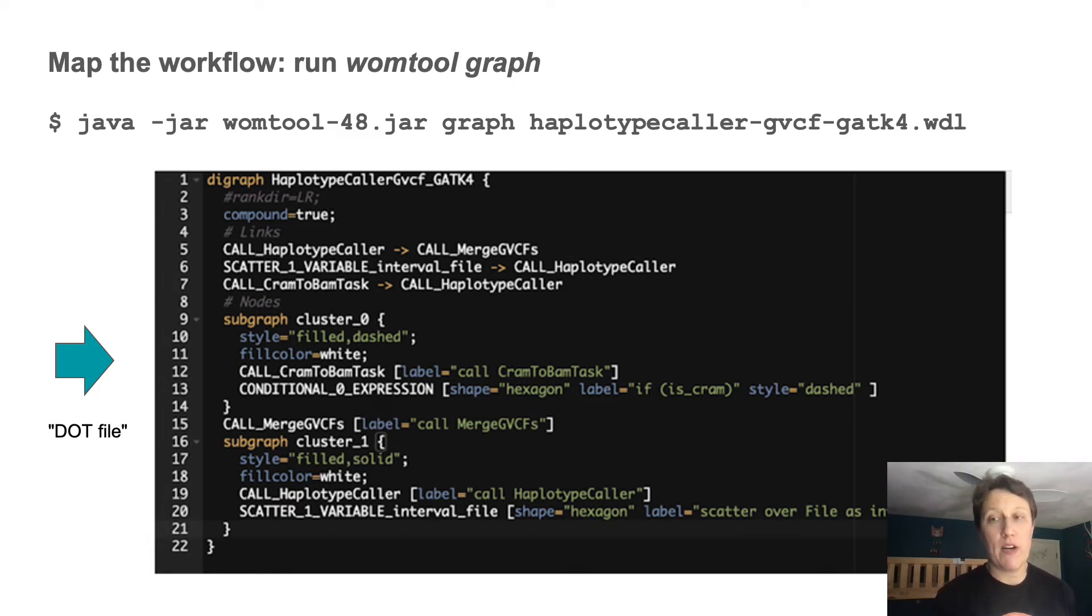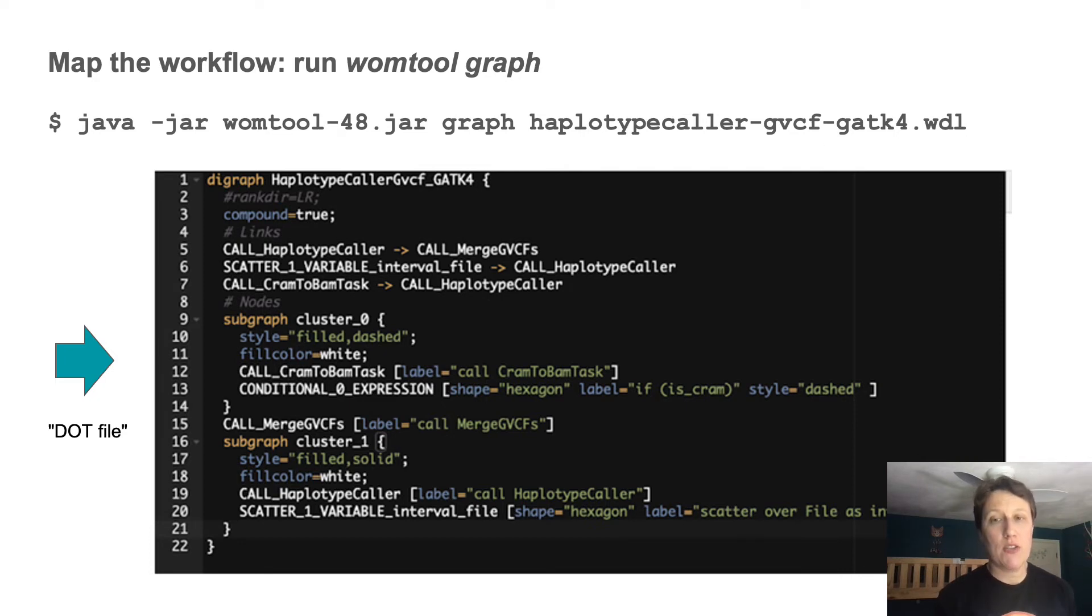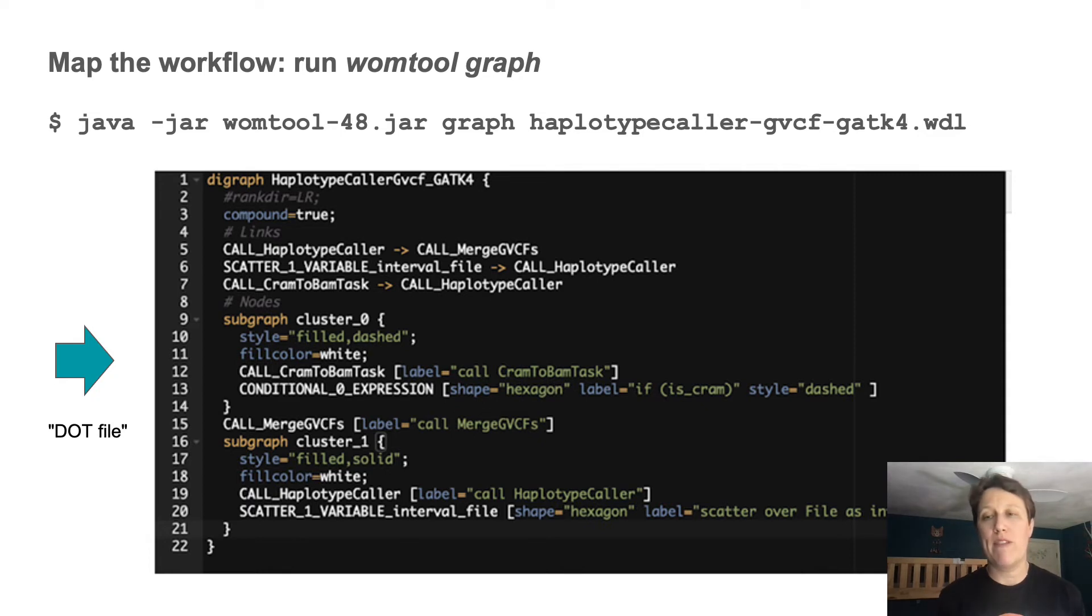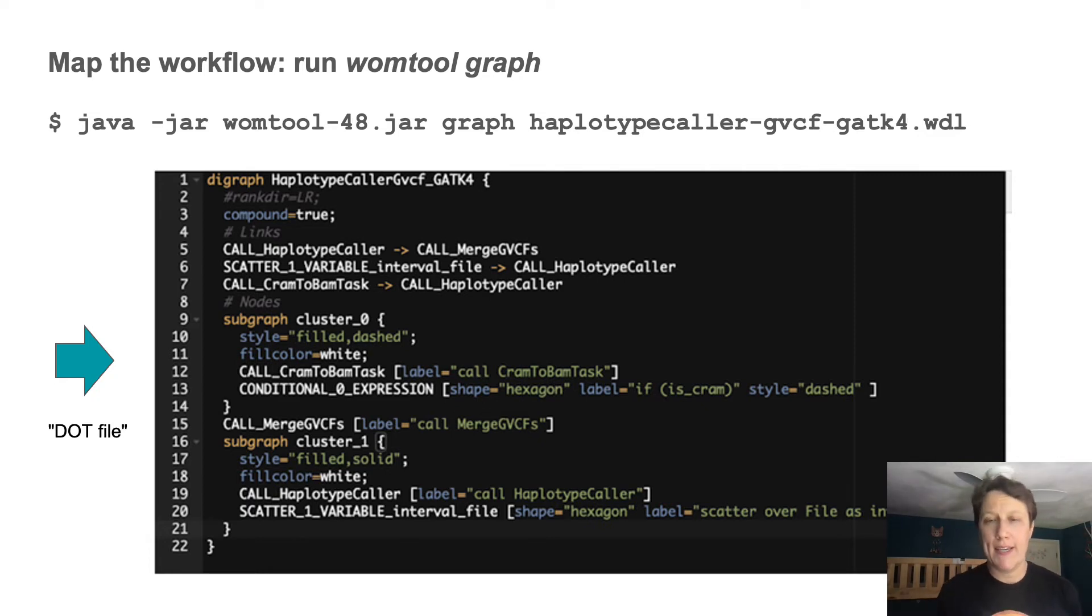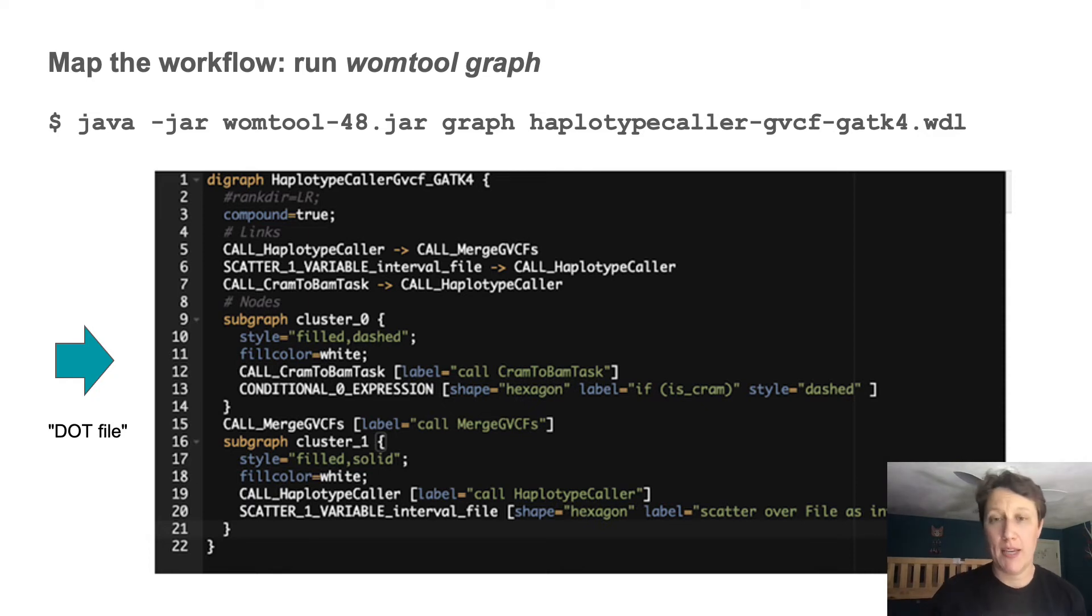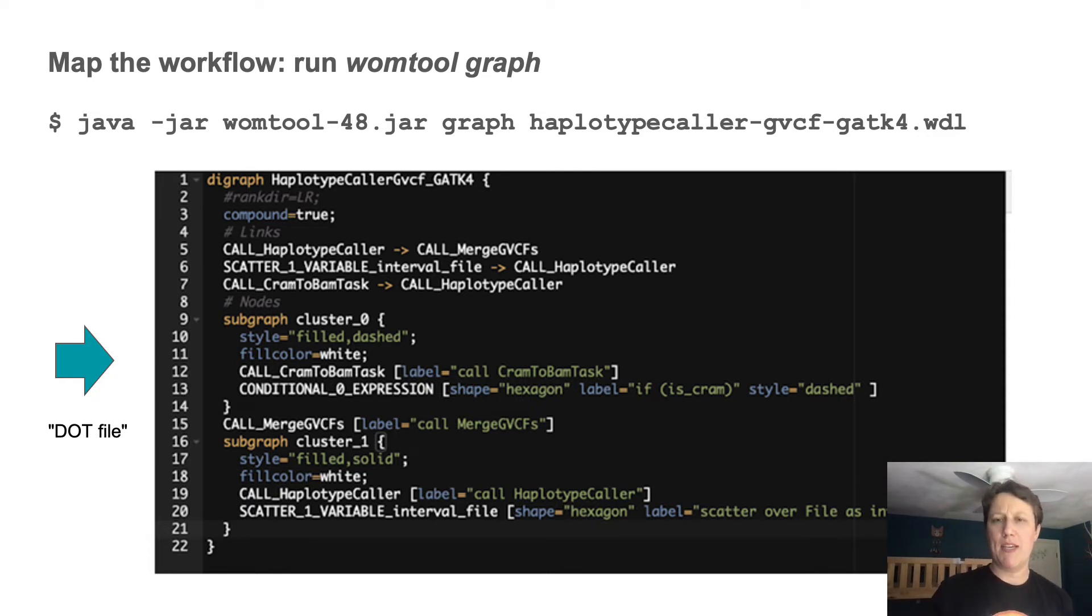So next, we run this file through a visualization package. And I just use a website called graphviz online, but you can run graphviz locally if you're willing to install something on your laptop, something I have not done since before the pandemic, and my life is better for it.